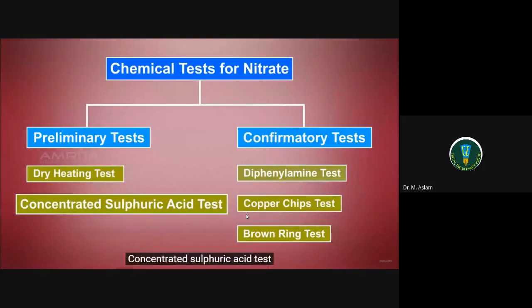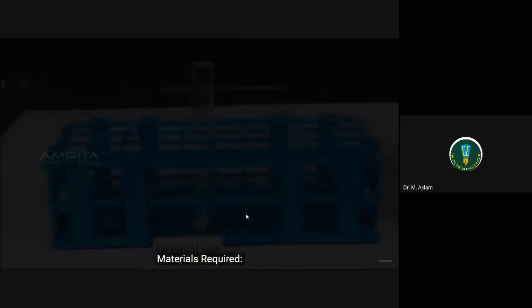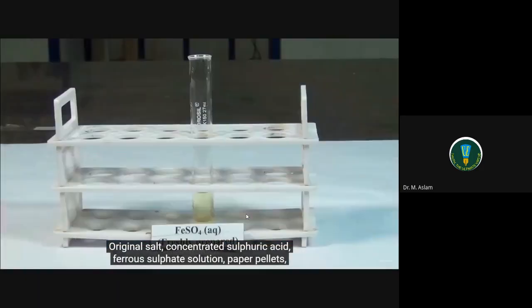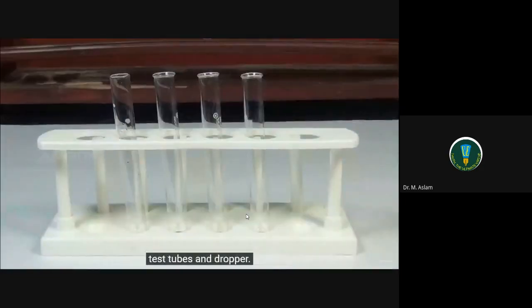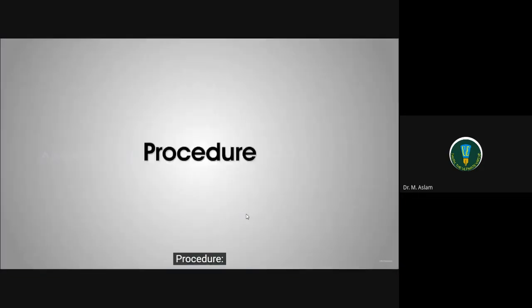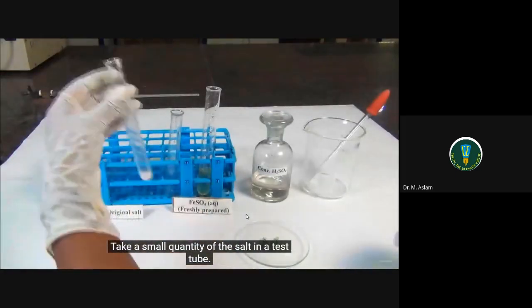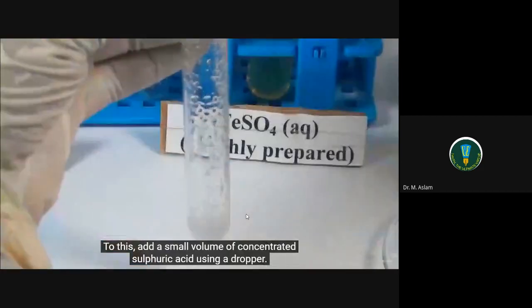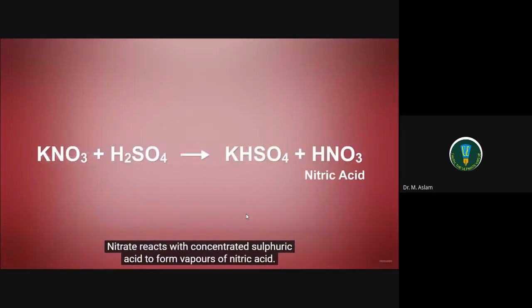Concentrated sulfuric acid test. Materials required: original salt, concentrated sulfuric acid, ferrous sulfate solution, paper pellets, test tubes, and dropper. Procedure: take a small quantity of the salt in a test tube. To this, add a small volume of concentrated sulfuric acid using a dropper. Nitrate reacts with concentrated sulfuric acid to form vapors of nitric acid.